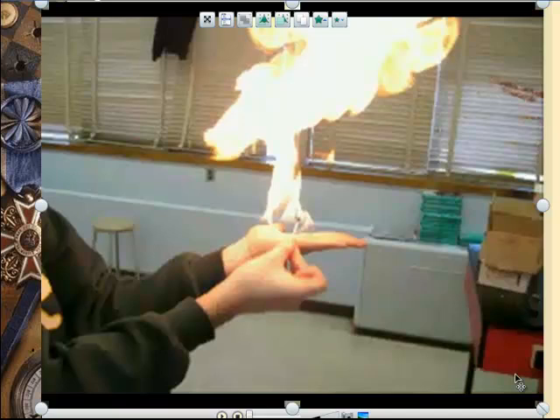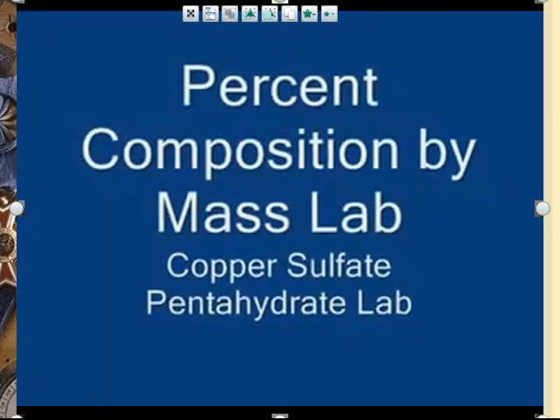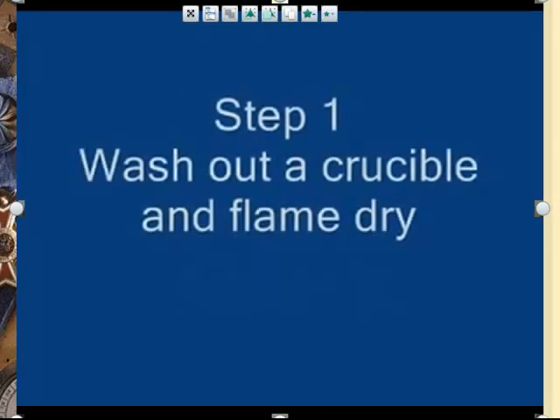Okay, so what I want to show you here is a demonstration of a hydrate lab being conducted. The substance that is being heated is CUSO4, copper 2 sulfate, or cupric sulfate, hydrated, meaning there's water molecules trapped in the crystal structure. So I want you to watch, and then we'll do the calculations when we're finished. So it's copper sulfate, now they tell you it's pentahydrate, we're going to figure that out based on the math.